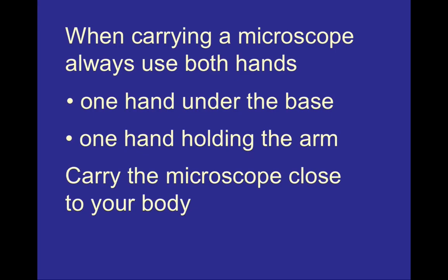Microscopes are very useful tools, and it's very important that we treat them with care. There is a method we use to hold microscopes to ensure we don't bump them against other structures in the lab or drop them. We always put one hand under the base of the microscope to ensure it doesn't fall, and we use our other hand to hold the arm. You keep it close to your body so that you have more control over this expensive piece of equipment.